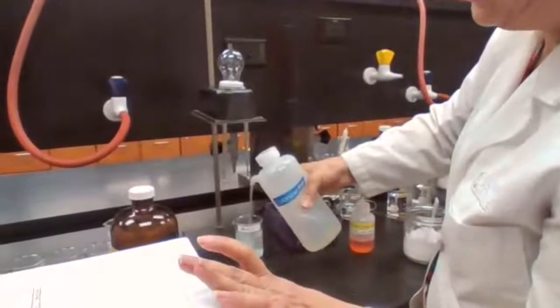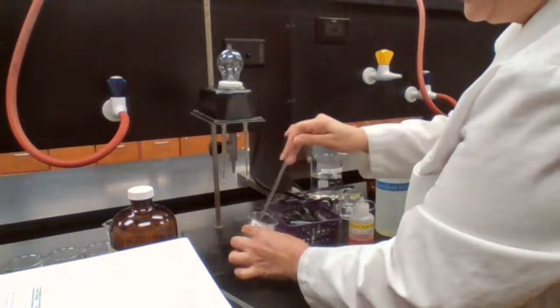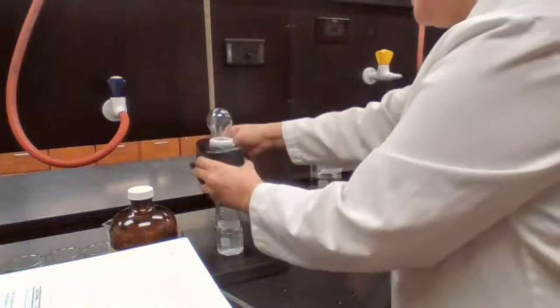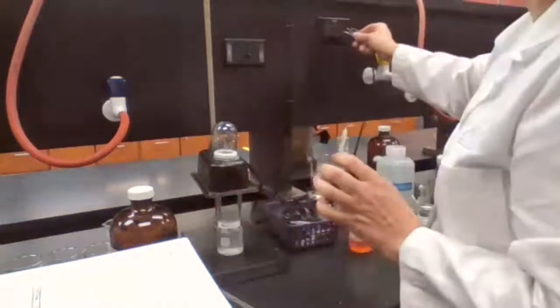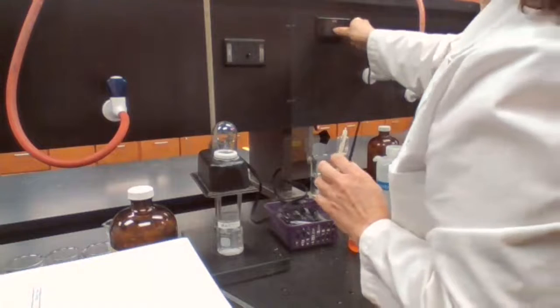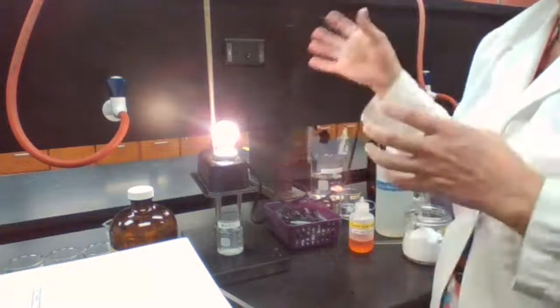So this is the proof that if your ions exist, the ions are there, but they are not mobile, it's not going to be an electrolyte. So your ions must actually be mobile. They should move around. So for sodium chloride, in the aqueous solution of sodium chloride, it gives bright light.